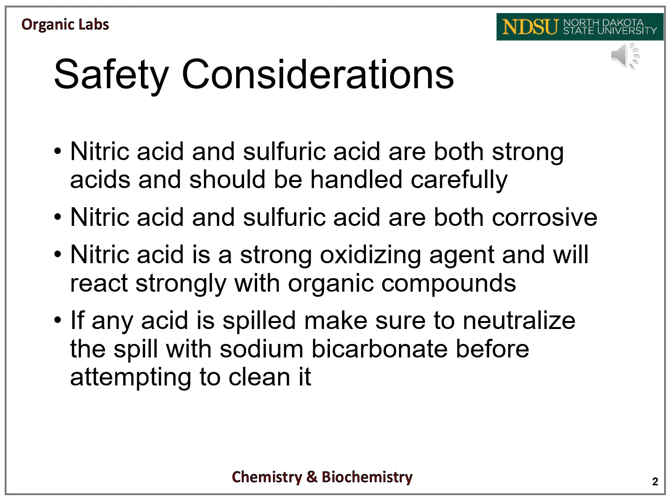Also, nitric acid is a strong oxidizing agent and will react strongly with organic compounds, so make sure to wash any glassware that contains nitric acid with water before trying to clean with another solvent like acetone. If any acid is spilled throughout the course of the lab, make sure to neutralize that spill with sodium bicarbonate before attempting to clean it with something else.